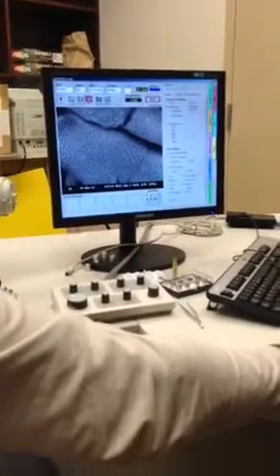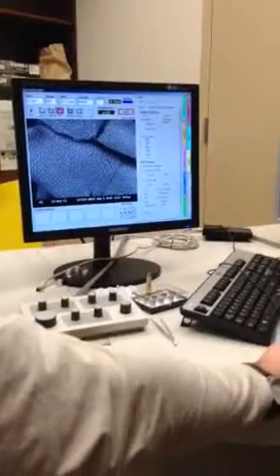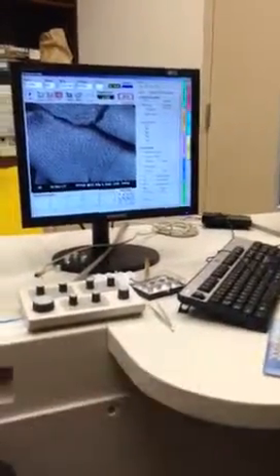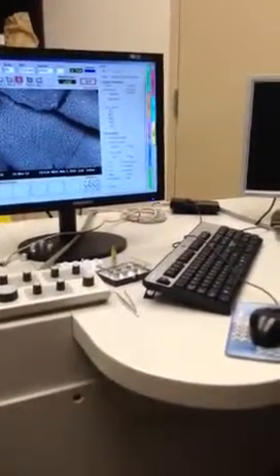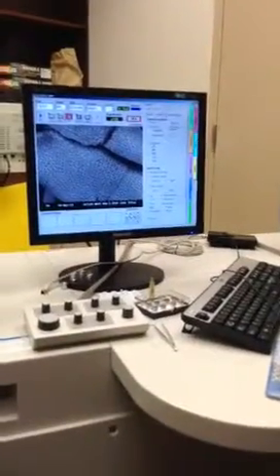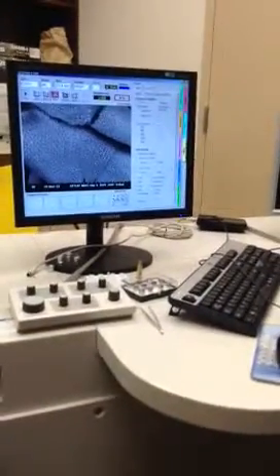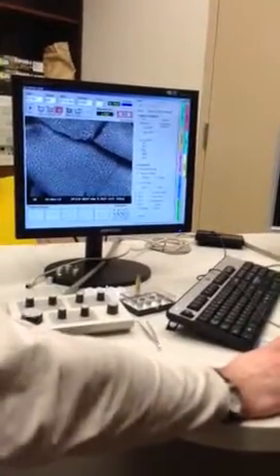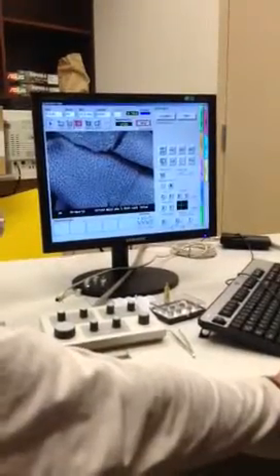Does the higher scan speed give you higher resolution? Higher scan speed actually tends to give you less signal because the beam moves faster over the sample. So they can be a little bit more noisy, but 200 seconds for what you guys are doing is kind of excessively long. You'll be sitting here for a long time waiting for each of your images to capture. 80 seconds is what we use most of the time. So let's try that again.